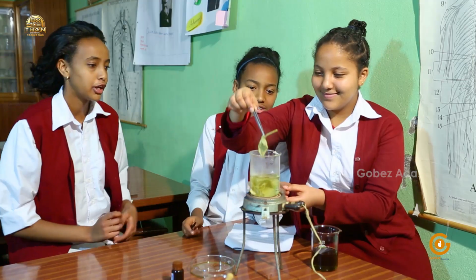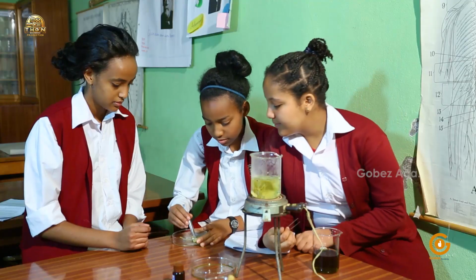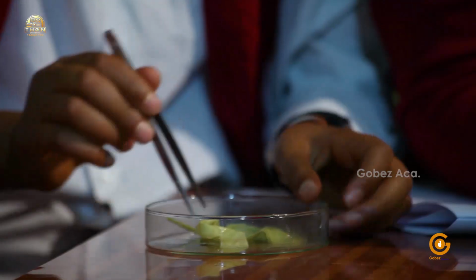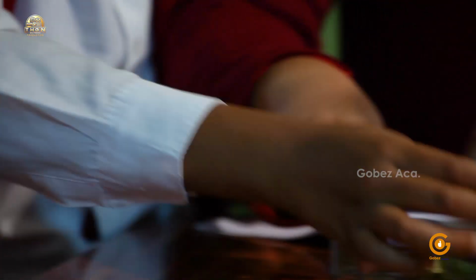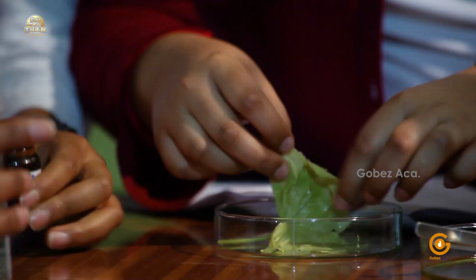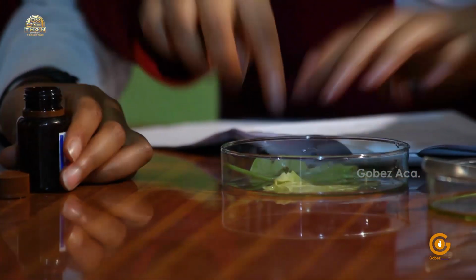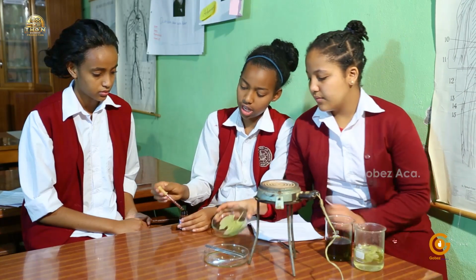Be careful. Let's add 2 drops of iodine.